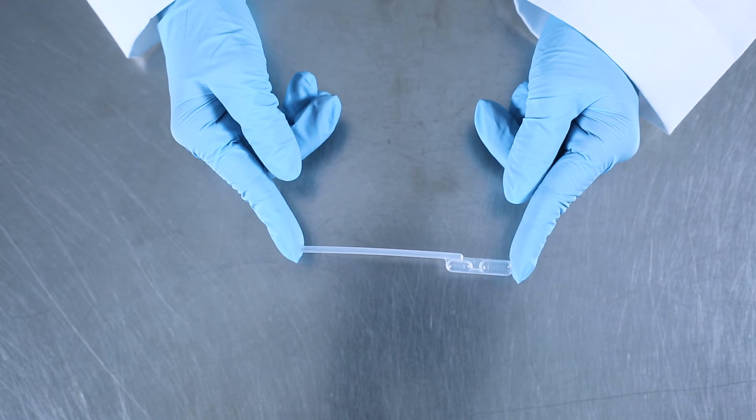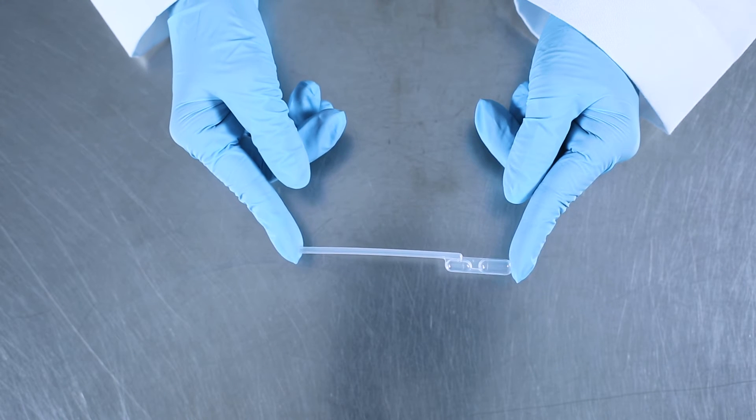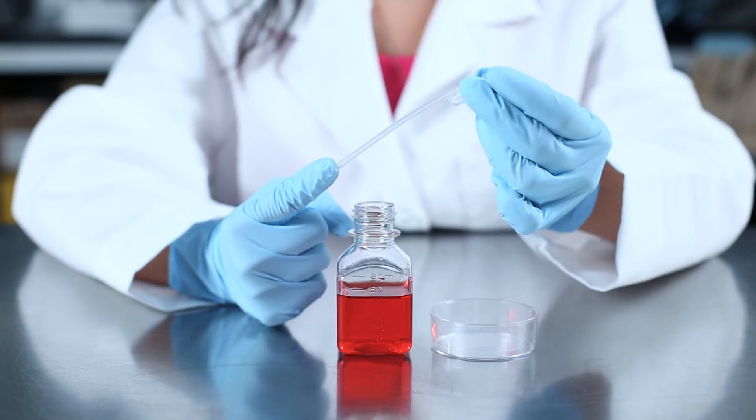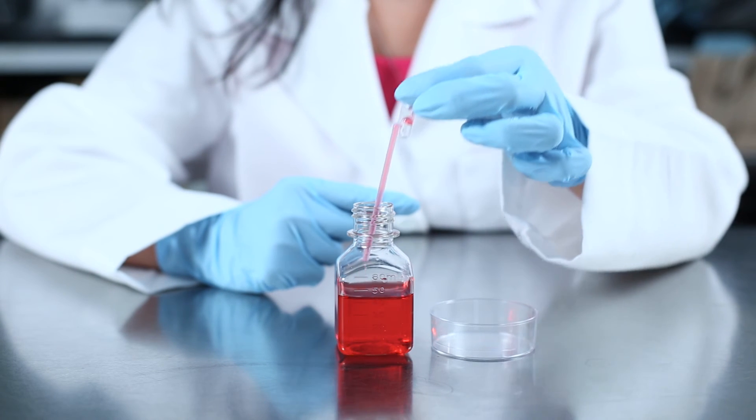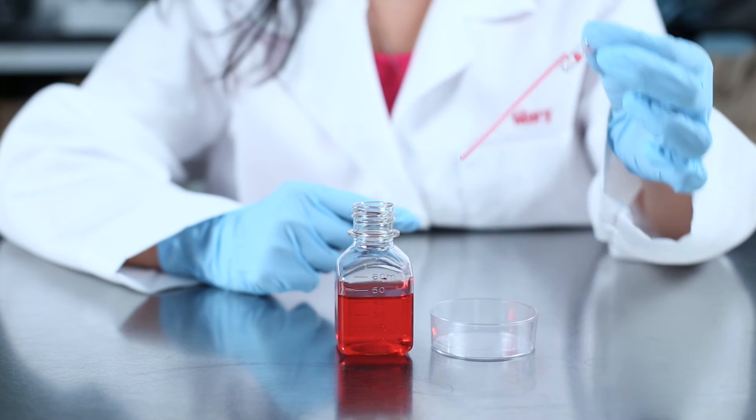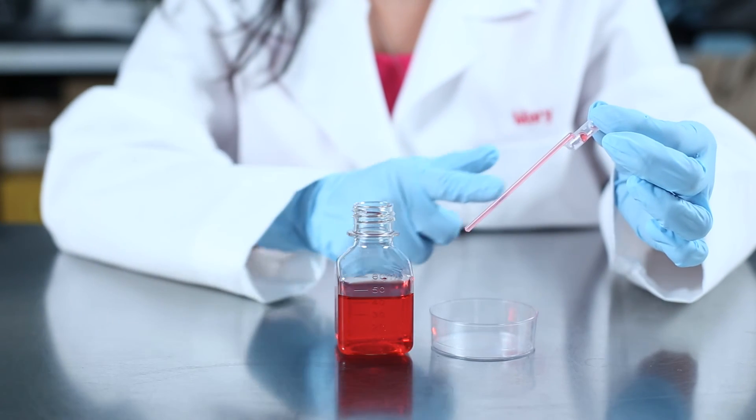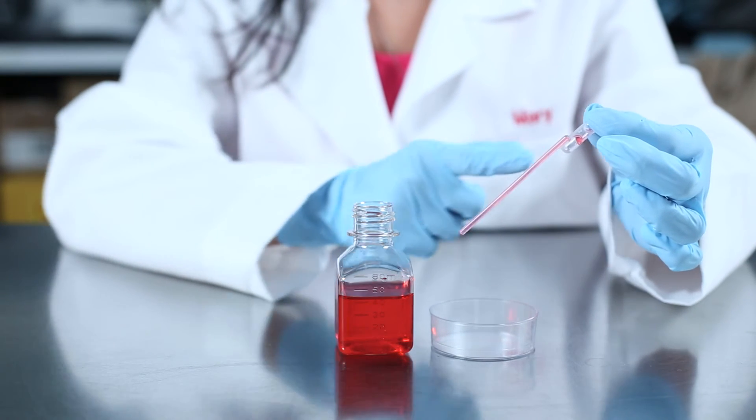Samco Exact Volume Transfer Pipettes dispense a precise liquid volume within a small tolerance. Our volumes range from 20 microliters to 400 microliters and we make custom sizes as well. Exact Volume Transfer Pipettes are ideal for rapid diagnostic kits.